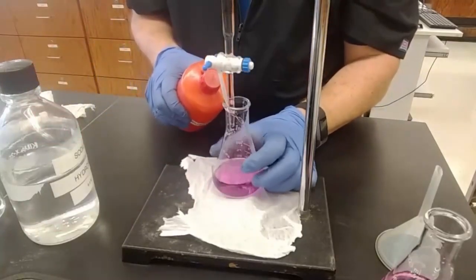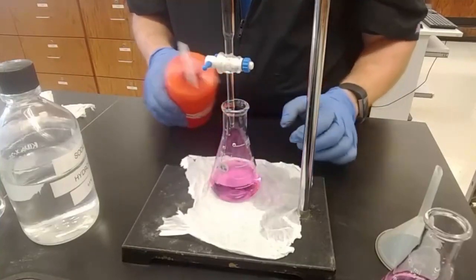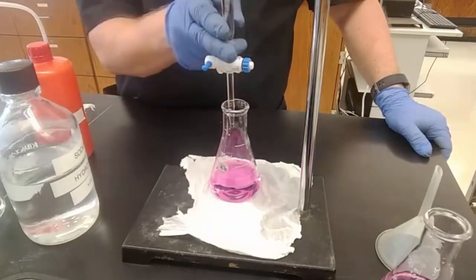Rinse down the tip just to be safe. Oh, it turned a little bit darker. You know what? I may have gone one drop too far, which begs the question after step 10: what is the effect on my result if I add too much base?